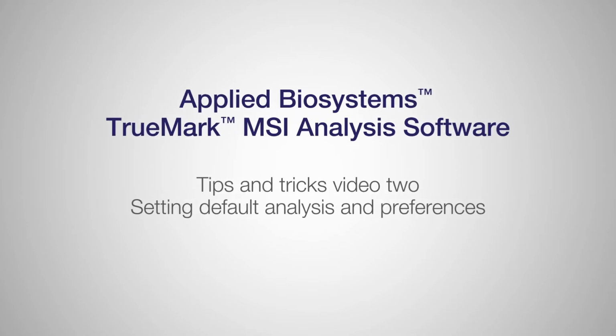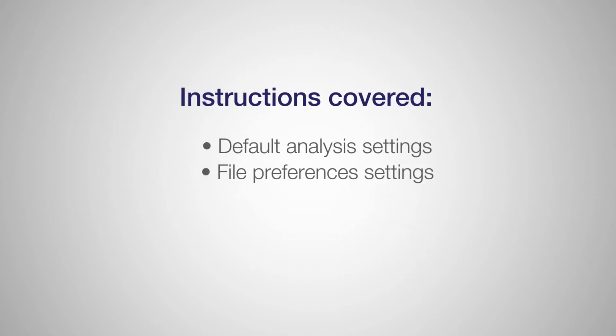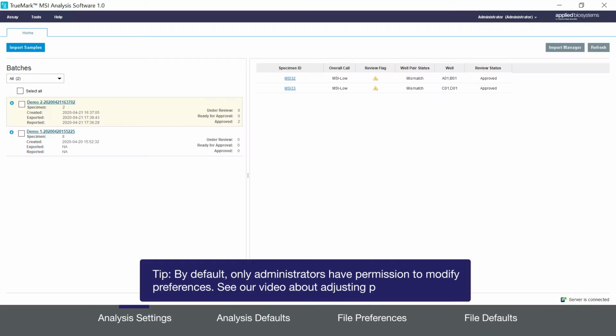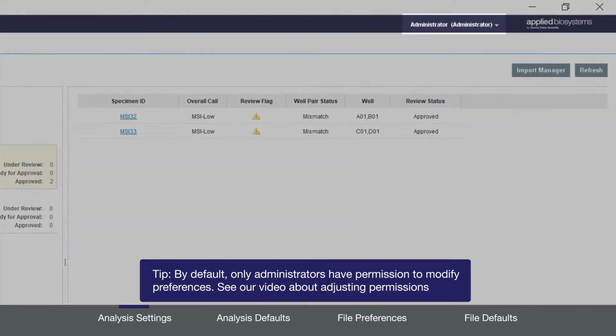Welcome to the second in our series of tips and tricks videos for the Applied Biosystems TrueMark MSI Analysis Software. In this short video, I'll cover how to set up default analysis and preference settings. For the purpose of this video, I'll be logged in as an administrator.